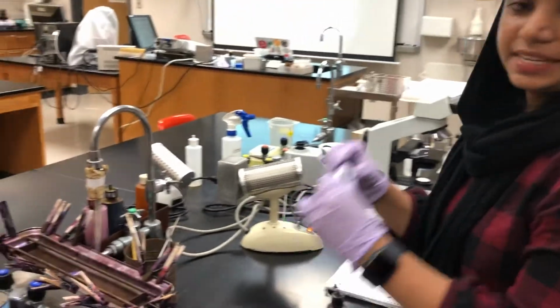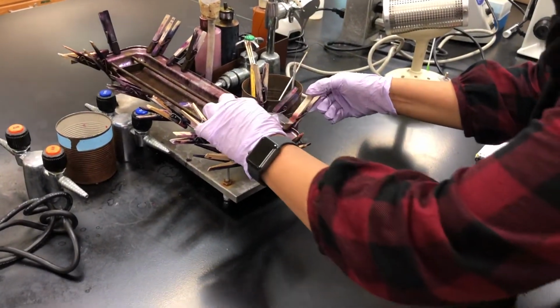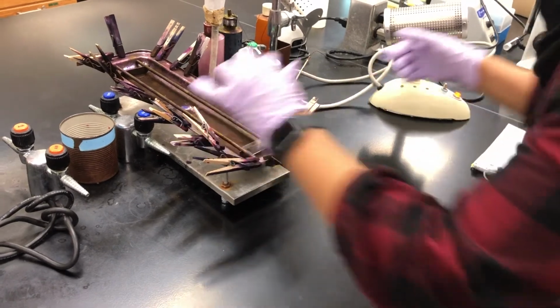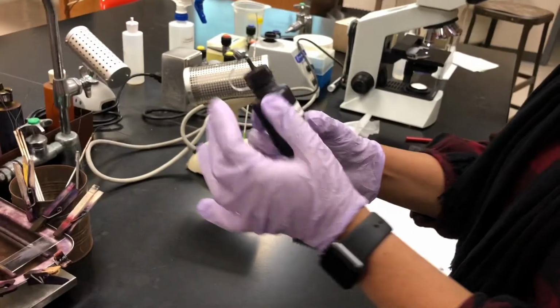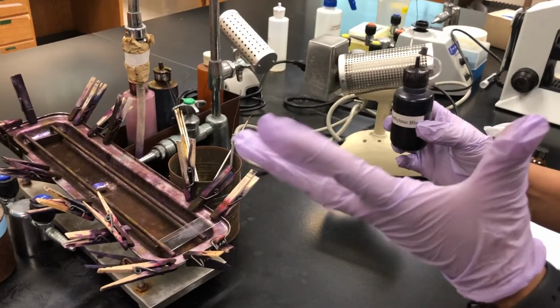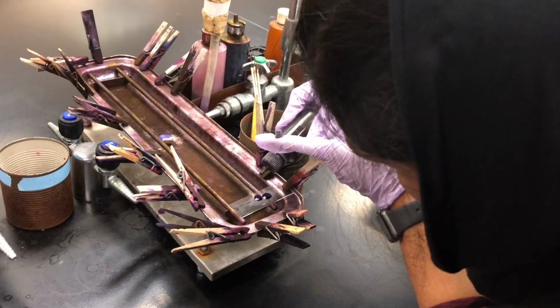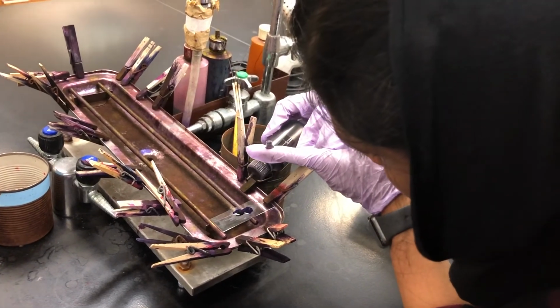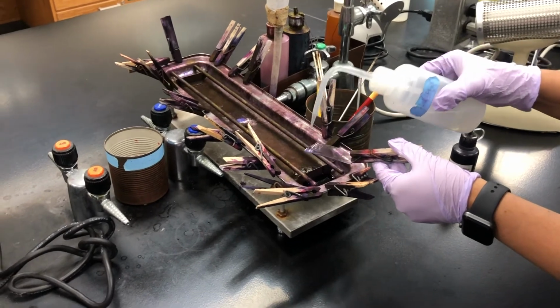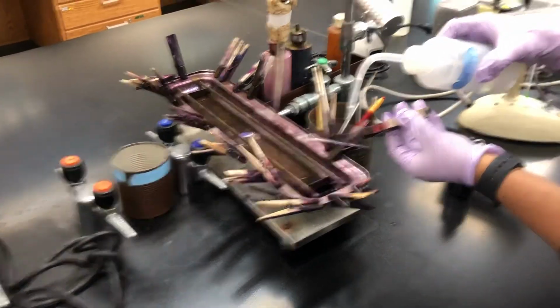I'm going to stain the slide. For that, I'm going to place this slide in the staining rack. See this? And now it's time to add the dye, that's methylene blue. So 1 to 2 drops is enough. Yep, like this. Then rinse the slide, making sure you're not forcing too much water on the main part.